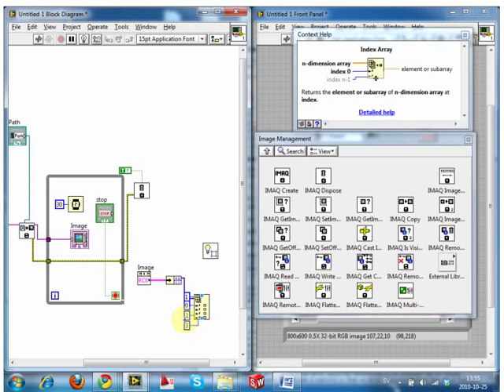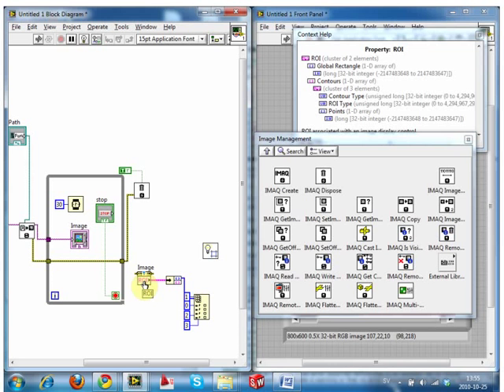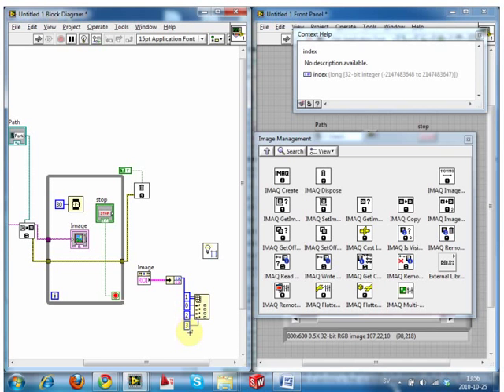Each element corresponds to a different element of the array. So in this thing, it says it's a 1D array. And if we go in here, it'll tell us it's got 4 elements. Okay, it's got x1, y1, x2, y2. There's only four coordinates that make up a rectangle. So we know there's only 4 coordinates, so we pull in all four index parts of the array. If we actually looked at index number 4, there would be nothing in it, because there is nothing in the 4th position of the array. The array isn't that big.